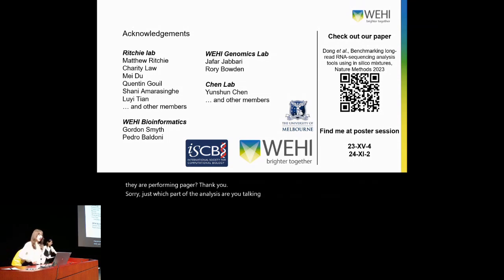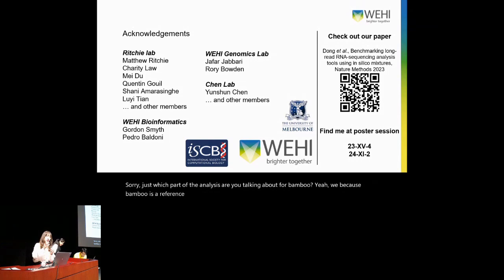For Bambu, yeah, because Bambu is a reference-based tool, so it uses the information from the reference. For example, which transcripts are there inside of the annotation, and they also have the junction information that is already annotated. So that's maybe part of the reason why it's helping Bambu to get a better result.